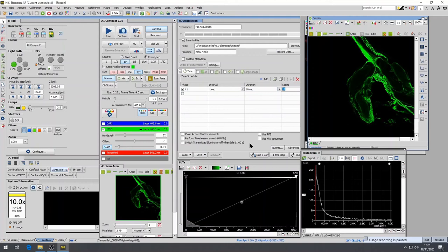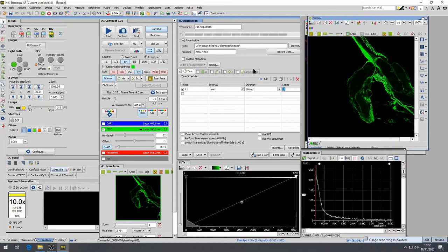Selecting the down arrow of the interval and duration field will allow you to change the units of time. Further, you can select no delay, interval, and continuous in duration to acquire images as fast as possible until you tell the acquisition to end.